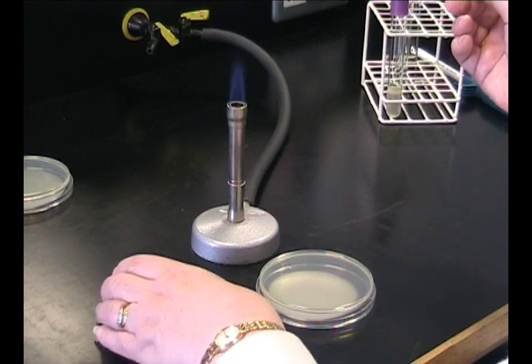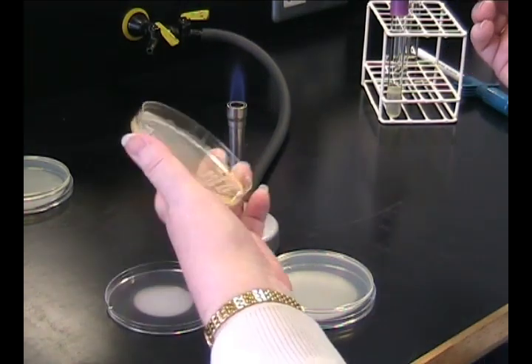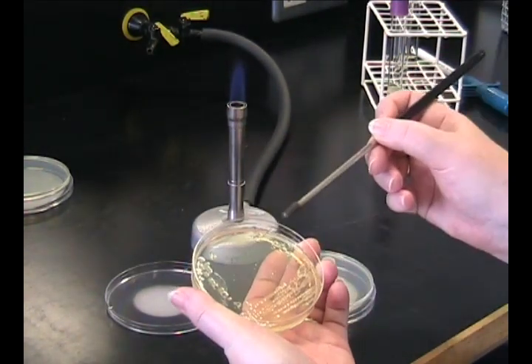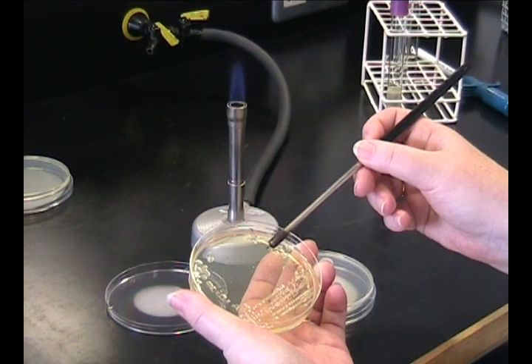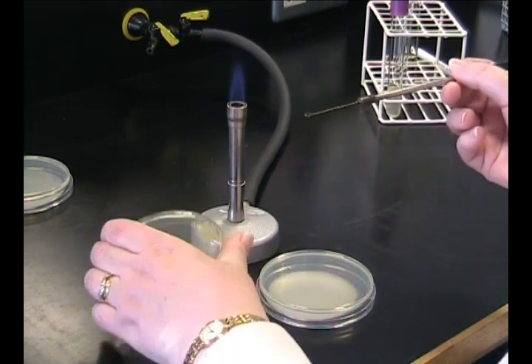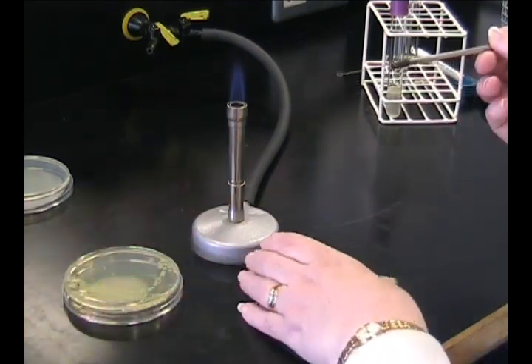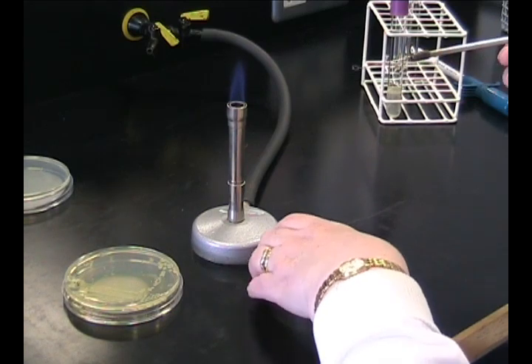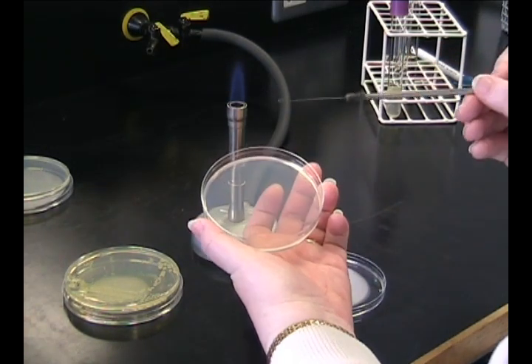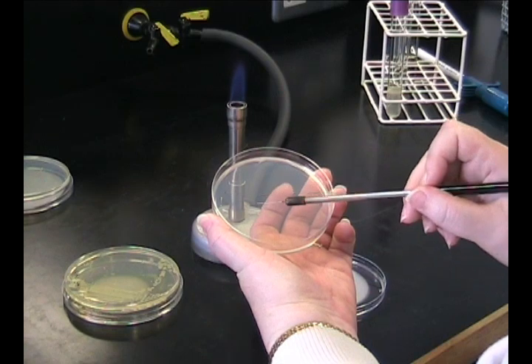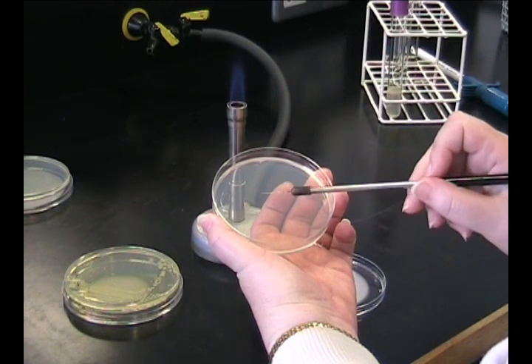Using your flamed and cooled loop, take a plate and remove an isolated colony from the plate. Place the lid. You're now going to streak this onto a brand new agar plate. First, you make a primary streak onto the plate.